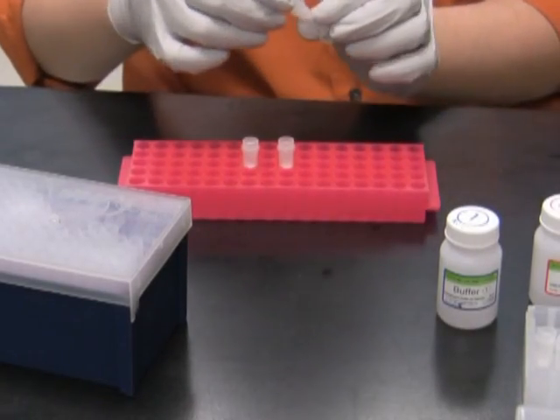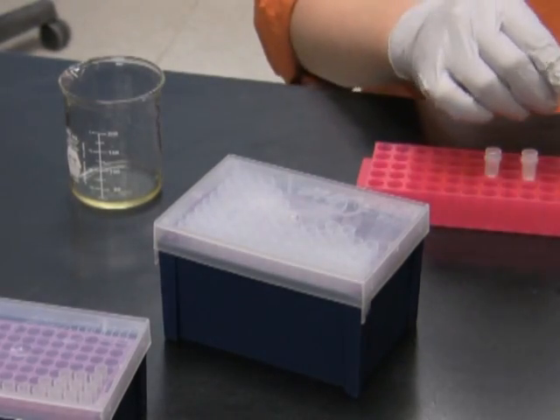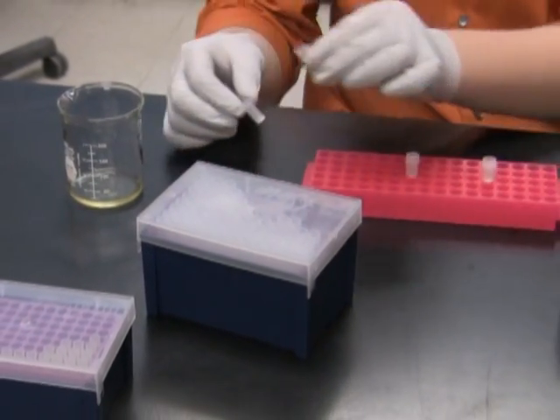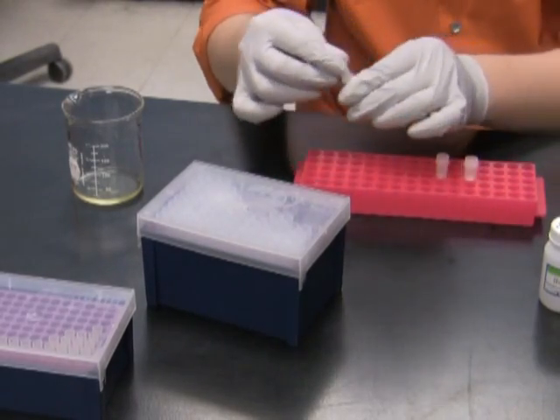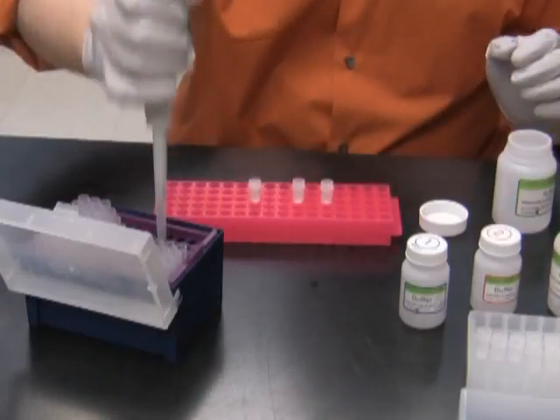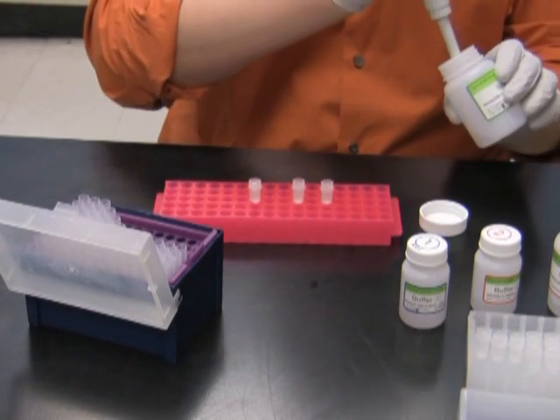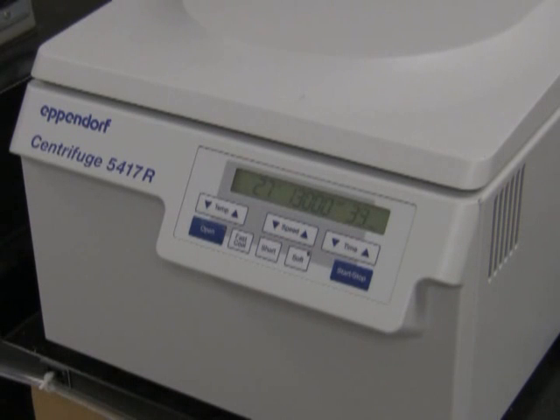Then I discard the flow through and add a wash buffer with ethanol to the columns. Then I spin in the centrifuge again.